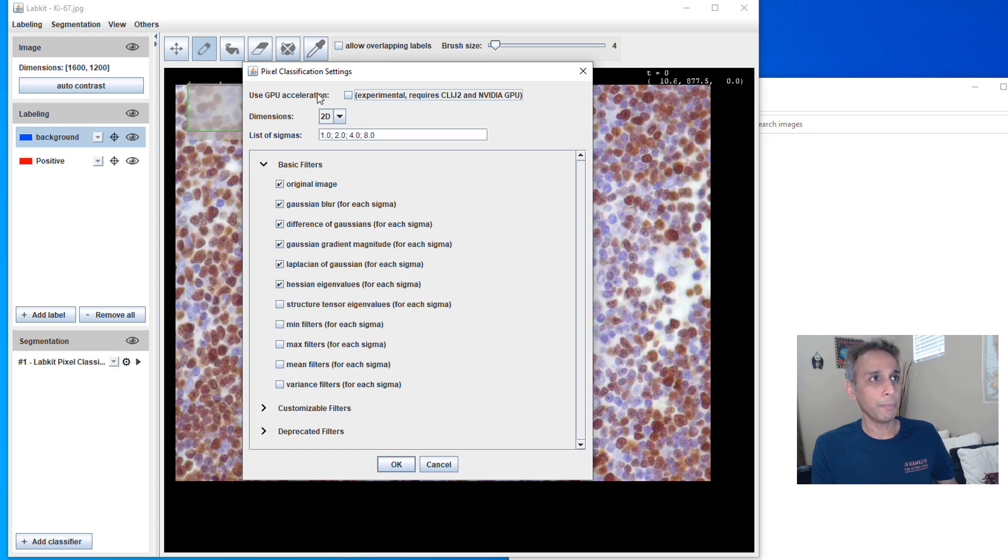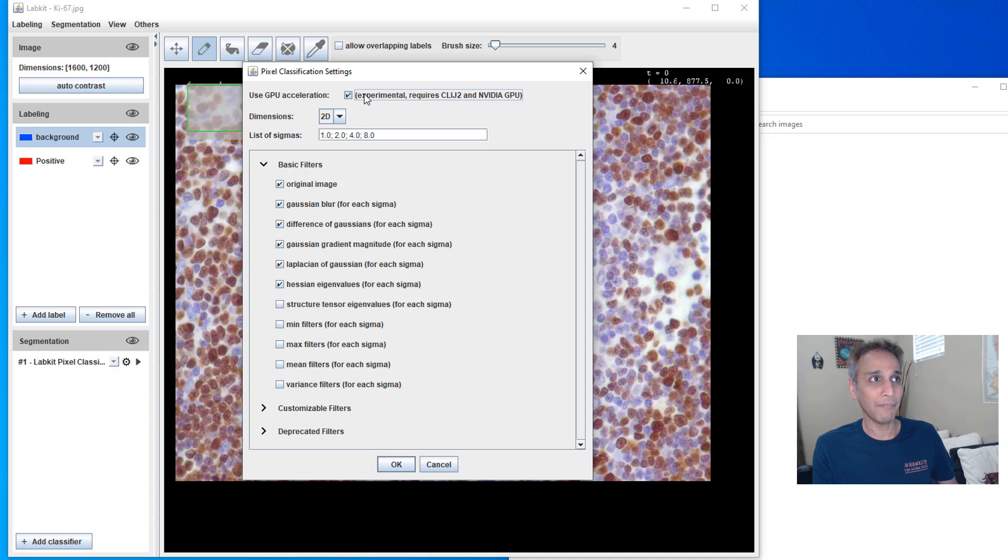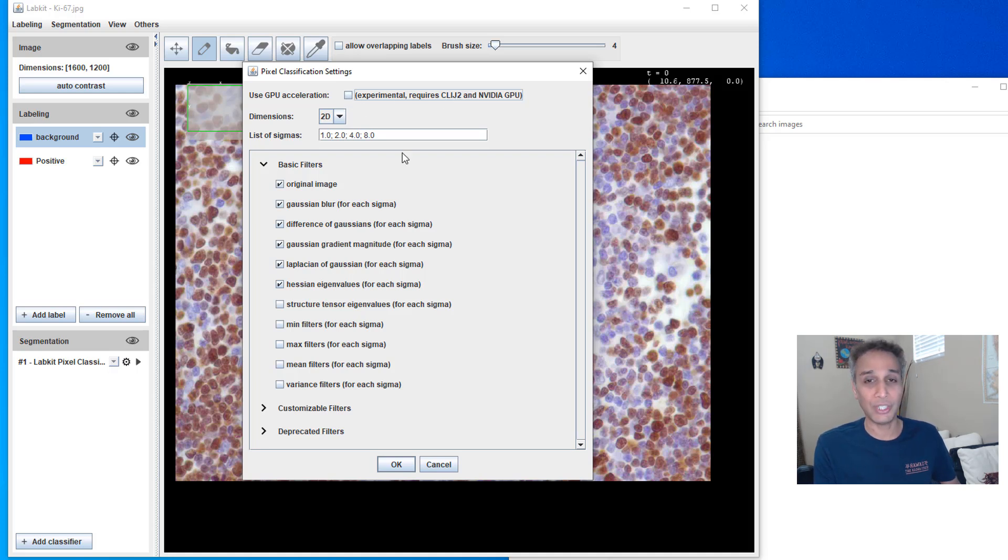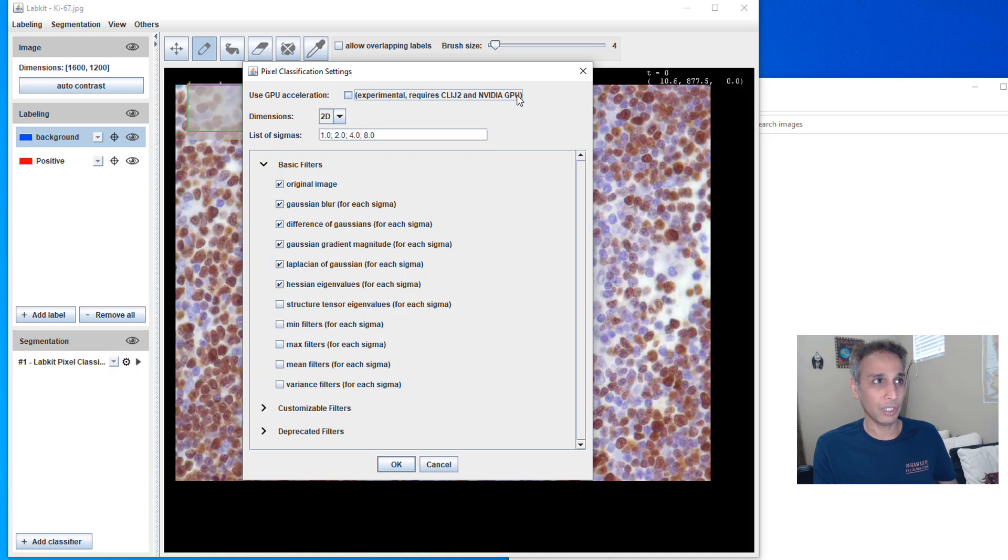It's a segmentation and when I click on the settings part right there, let me bring it back into the screen. So use GPU acceleration. Go ahead and check it if you have GPU. I do have GPU NVIDIA on this system and it requires CLIJ2. I haven't done anything with that. I haven't installed that. So let me uncheck that.